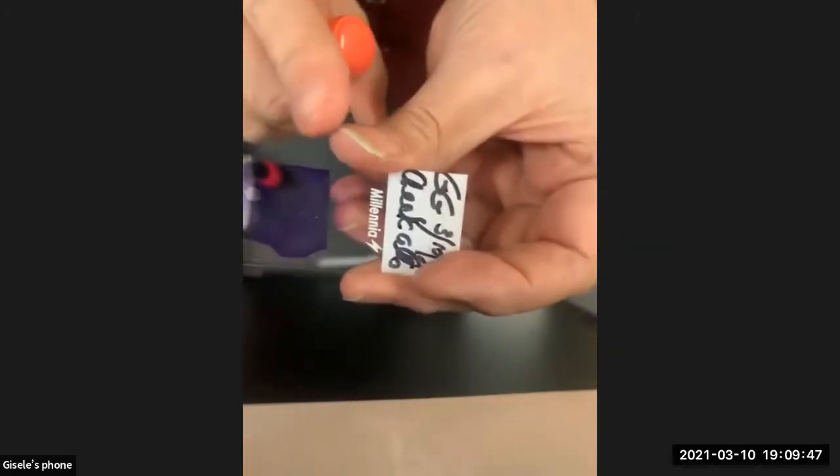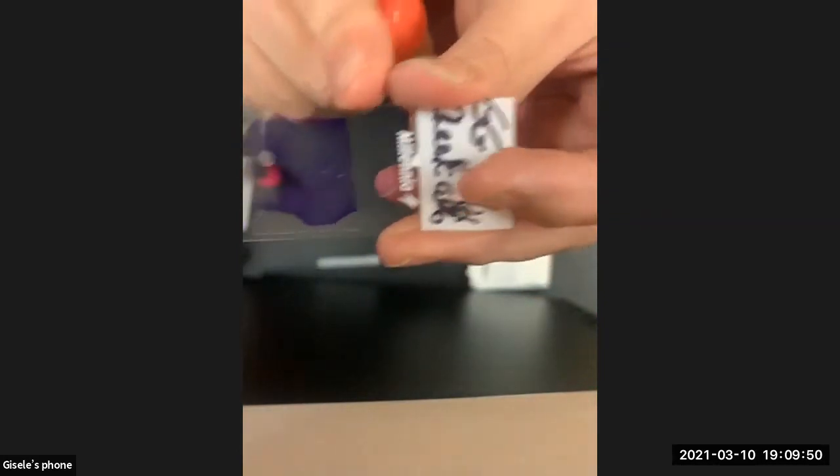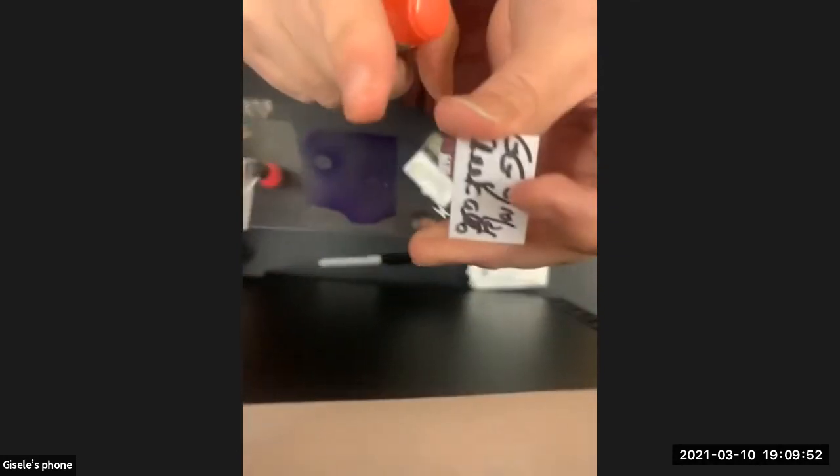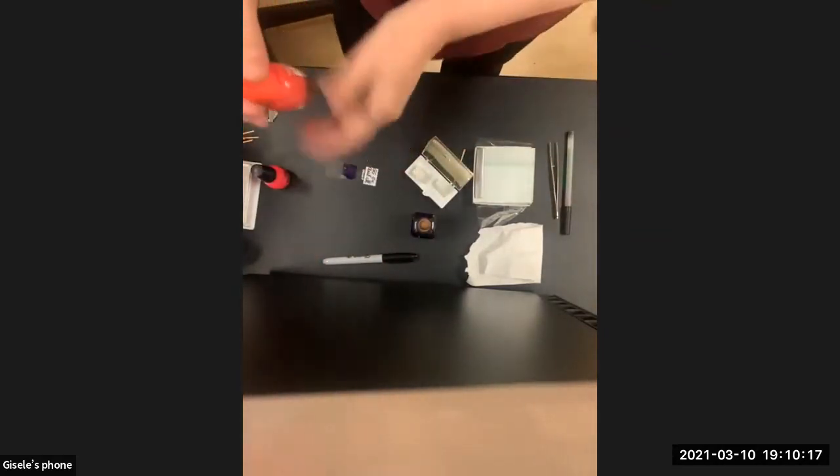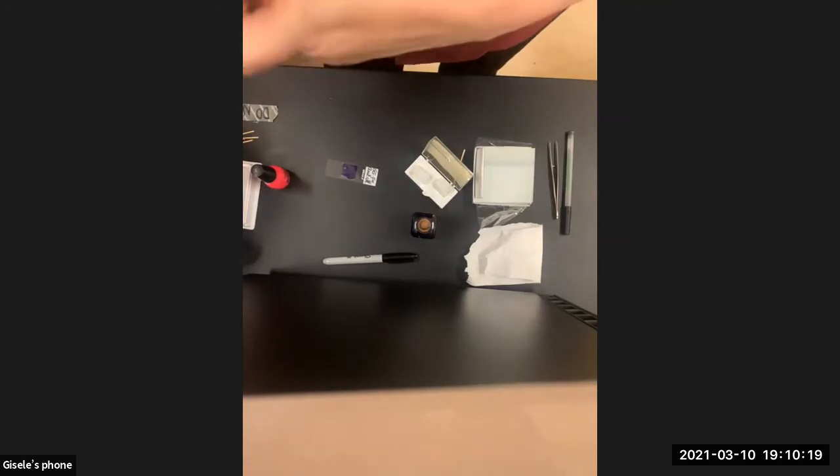If you're in histotech, there are different ways of sealing a slide. This is a very common way, although a histotech will have fancier versions of this. And actually you can sometimes seal it with just what's under the slide. In our case, when we're putting some fluid, like some saline, a homemade slide, nail polish is amazing. Choice of colors, it doesn't matter. I like to color code. I go to the dollar store and get all sorts of cool colors.